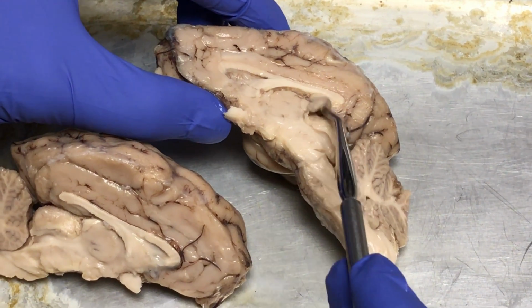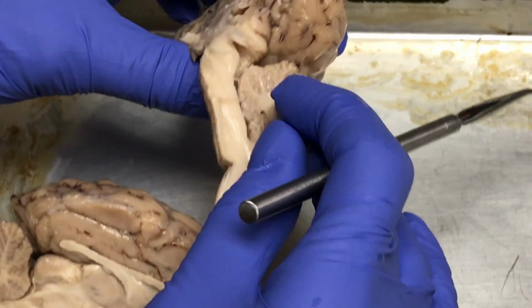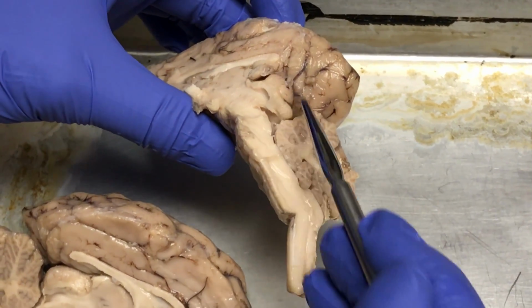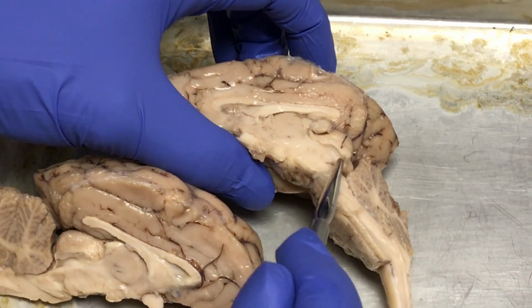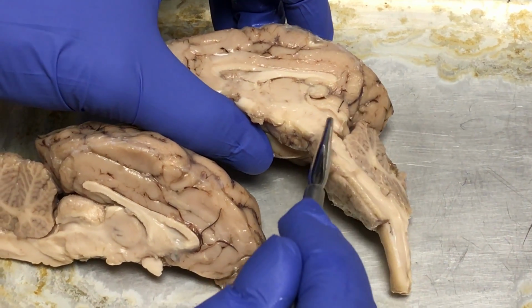Okay, and the pineal gland's right next to the corpora quadrigemina. So if you pull the cerebellum back, you can see this better. You can see the little bumps here. That's the superior colliculus and the inferior colliculus, or you can just call the whole thing the tectal plate or corpora quadrigemina. Okay, that is the cerebral aqueduct, that kind of groove right there.